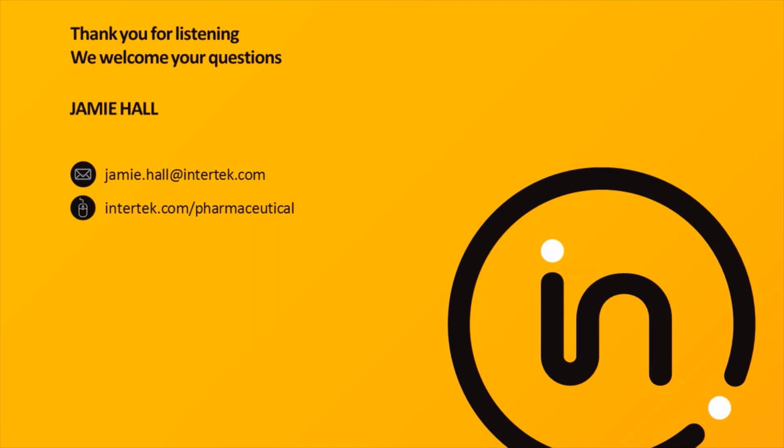Okay. And it looks like we have just time for one more question. So would a regulator expect potency data from flow cytometry and also another orthogonal technique? So that's a really good question. There are, of course, other means of measuring potency, and the method that you choose can depend on a lot of factors. So whether to include data from one or more approach would depend on the biologics molecule in question, its mode of action, and also the phase of the development.